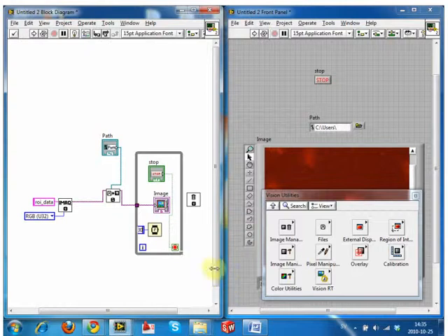Doesn't really matter what the number is. I mean, you could set it to whatever, 30 or 35, whichever one you want. Basically gives you it as real time. You can make it longer, and it displays it once every however long you delay it for. There's no need to make your computer work harder than it needs to, and we don't run faster than 30 frames per second, so it's silly making the computer.